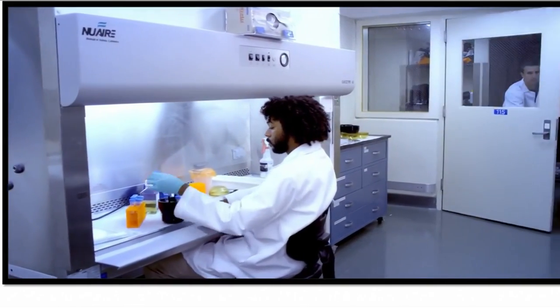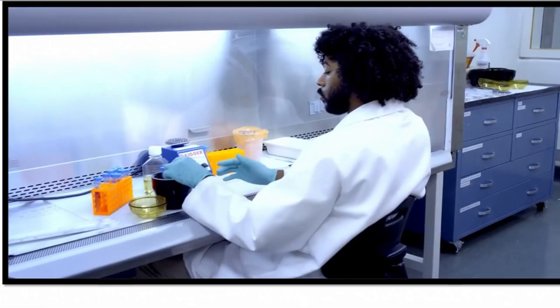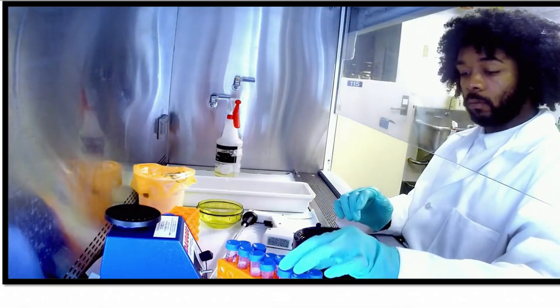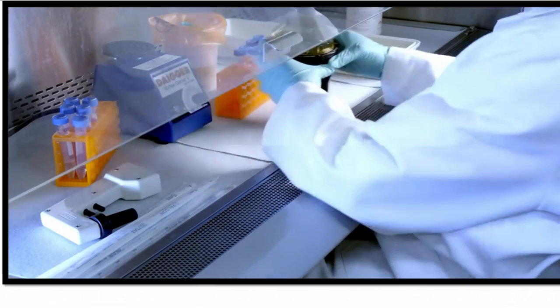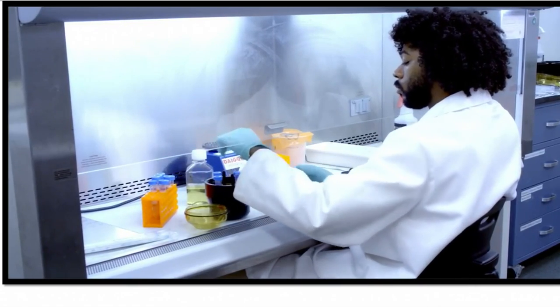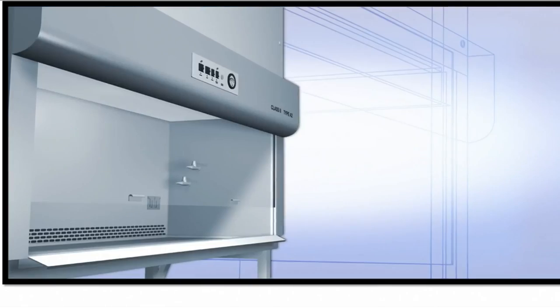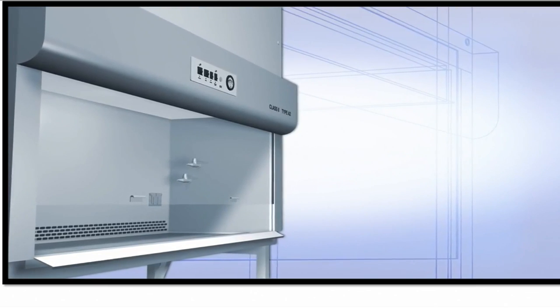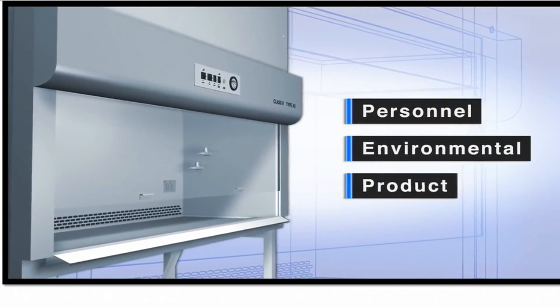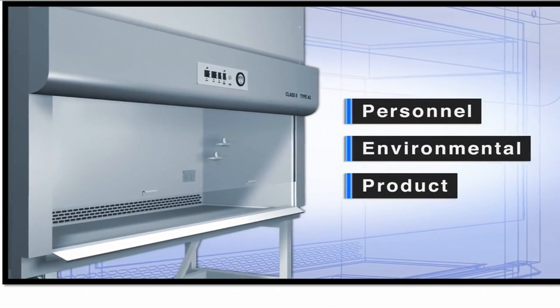This video demonstrates how biological safety cabinets work to protect you, providing protection to laboratory workers, product, and the environment, while reducing the risk of exposure. Thoroughly understanding how a biological safety cabinet works while following established lab safety protocols will help prevent contamination of your work and protect you at the same time. When used correctly, a properly installed and certified biological safety cabinet provides personnel, environmental, and product protection for work with biological materials, including infectious agents and recombinant DNA.